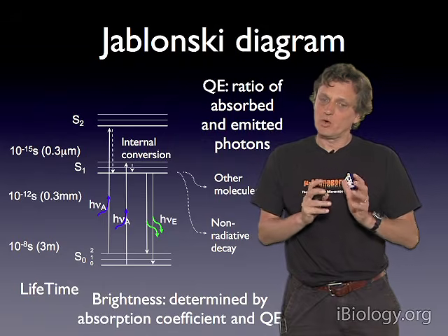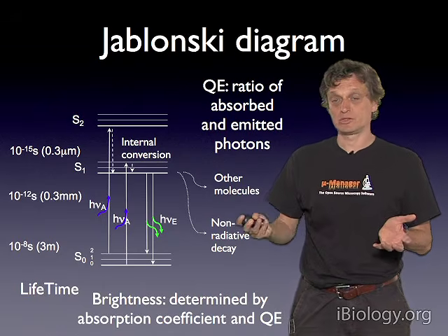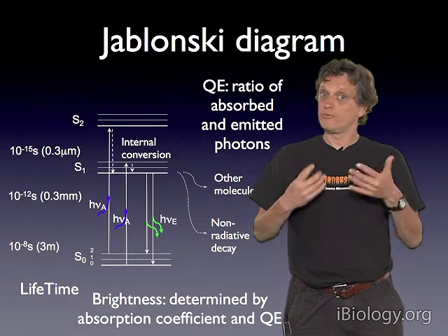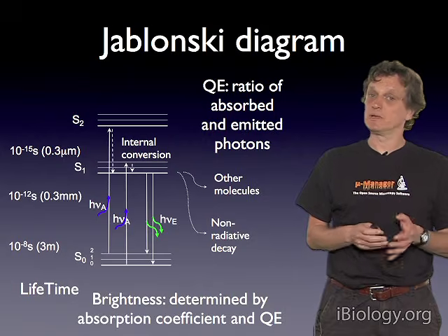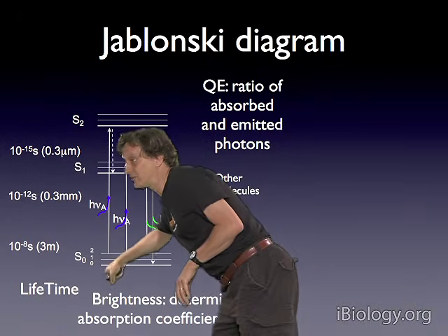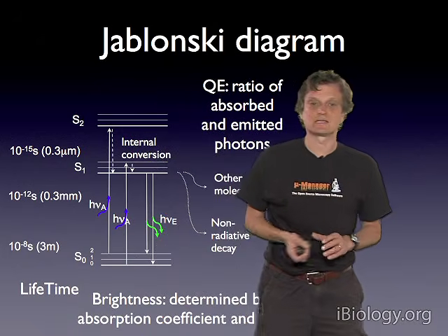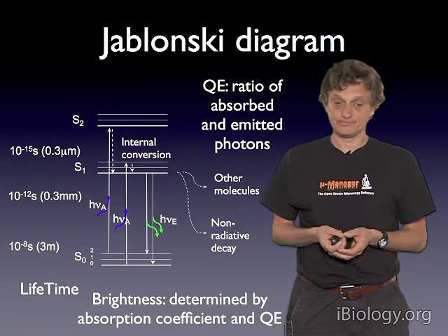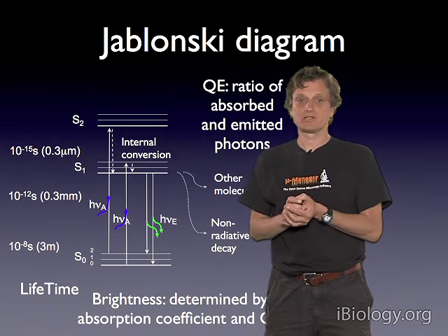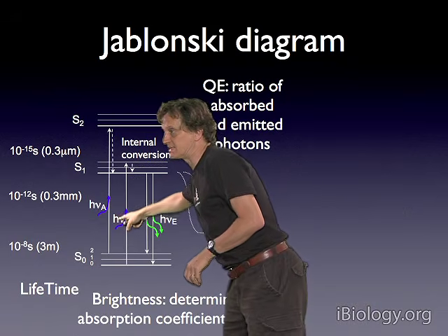Nevertheless, it's also a parameter that is dye specific and dependent on the environment of the dyes. And there's a whole form of fluorescence microscopy called lifetime microscopy that actually reads out lifetime instead of only reading out the fluorescence itself.